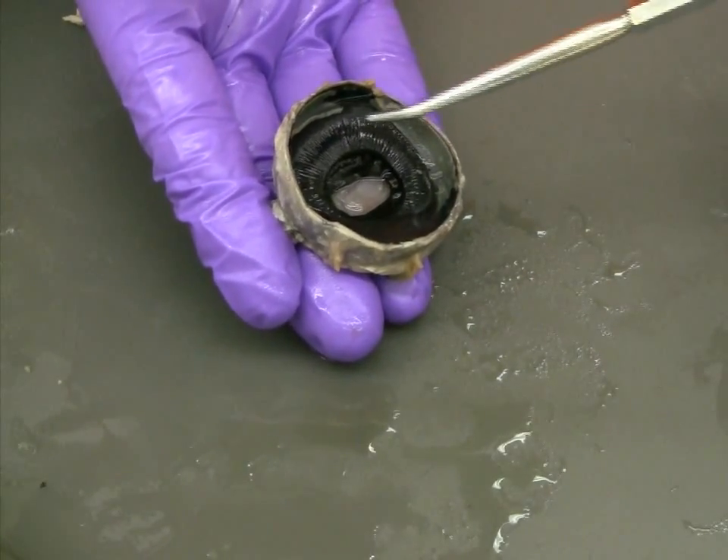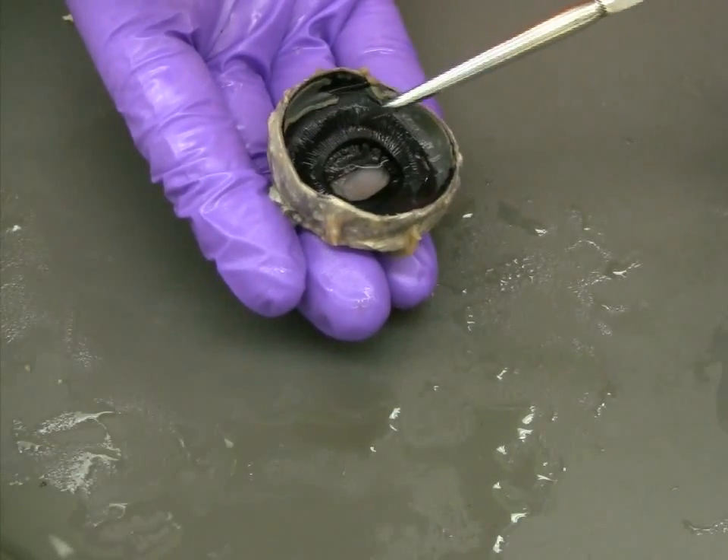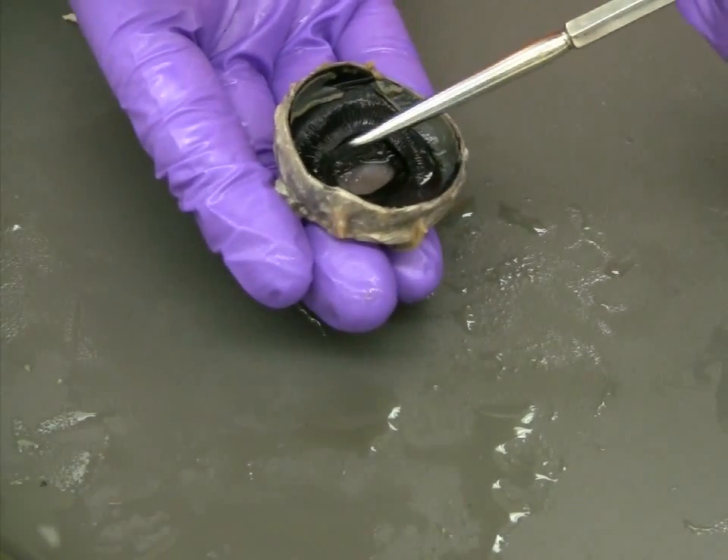Examining the intact iris in the eye, you should see a ring of dark fibrous tissue surrounding the area where the lens was removed.